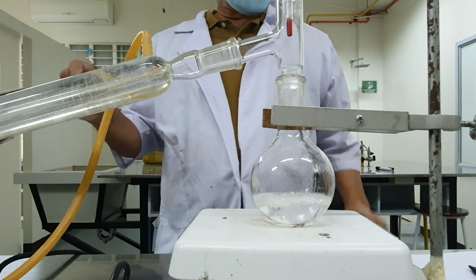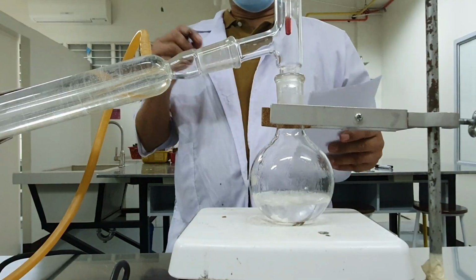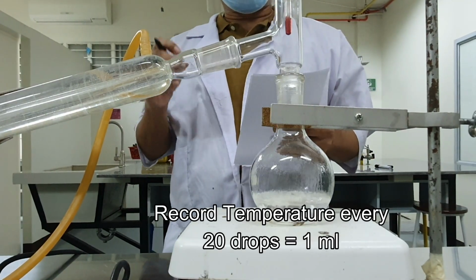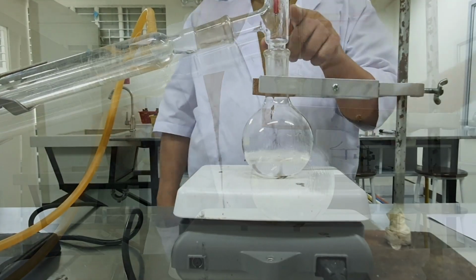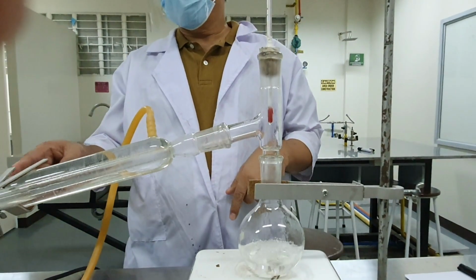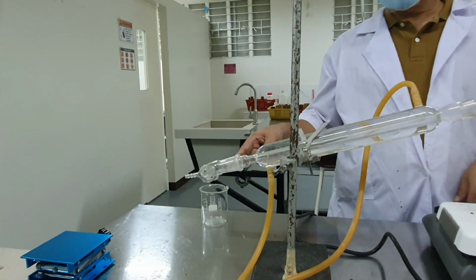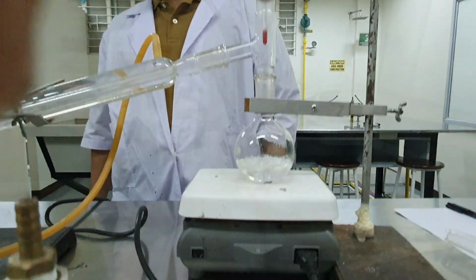So let's see what you're going to do, class, okay? What I'm doing now is I record the temperature every 20 drops or 1 ml. So I'm going to record it in ml. If you notice, class, you already have the condensate. It's coming out already. See, so I'm going to count. Okay, 20 drops is 1 ml.